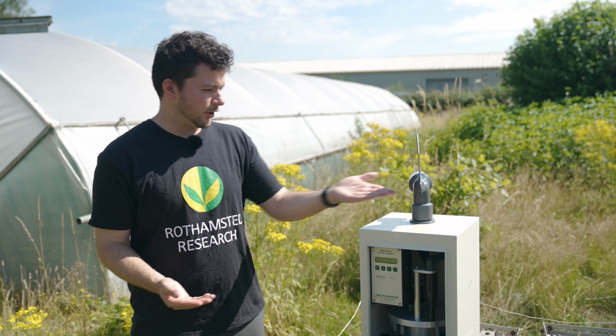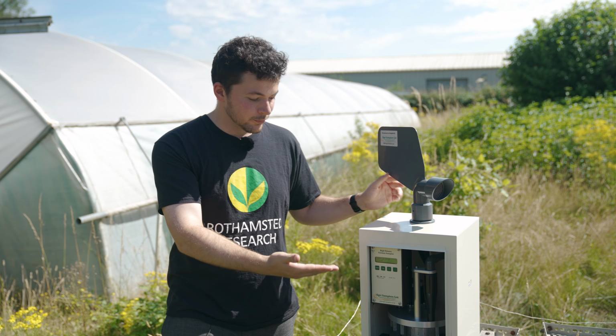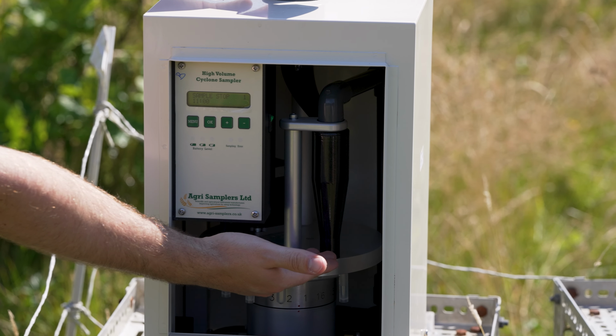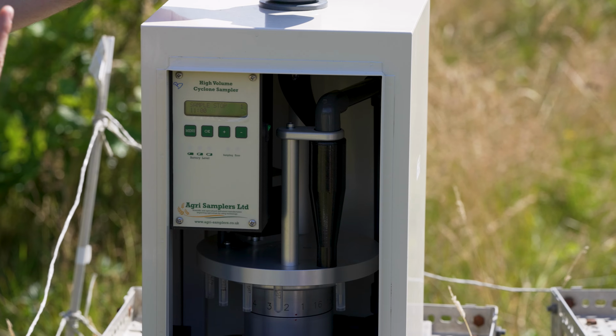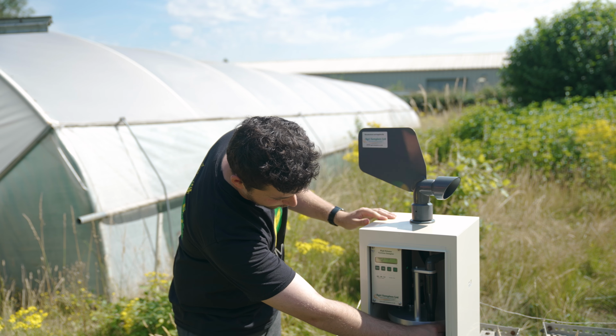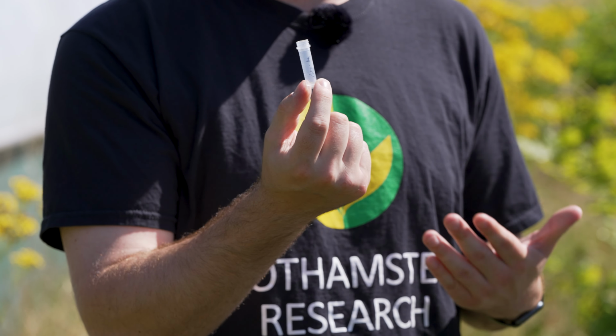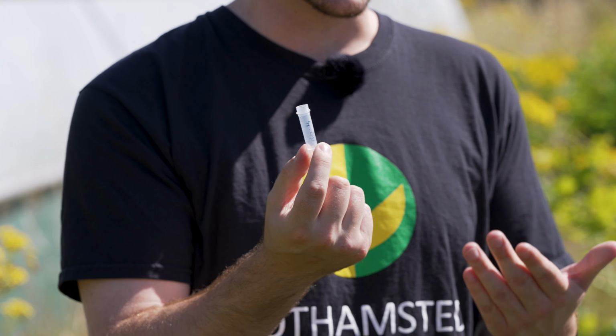So the way that the sampler works is that air is taken in through this inlet here, and it's forced through this black column, and the air is actually vortexed through the column, something that you'd see like in a vacuum cleaner. And then the air is deposited in these tubes here. And because it's already in a tube, it really speeds up our downstream analyses back in the lab.